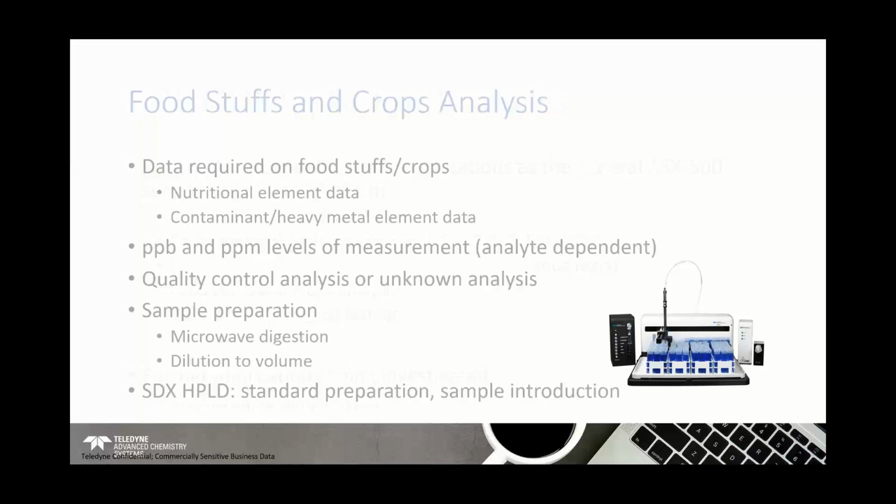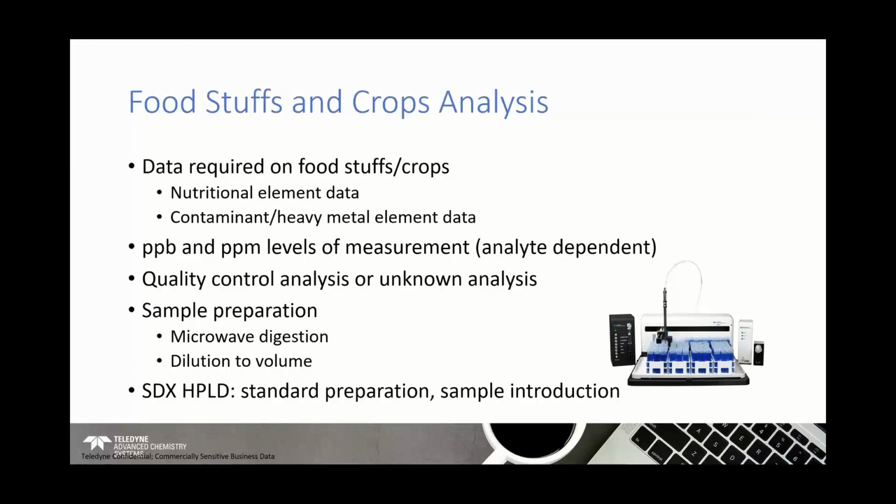So from that list, what I wanted to focus on was two areas of application. So I'm going to focus on foodstuffs and crops, etc., and then also waters analysis. But as part of this discussion, what I wanted to do was bring in and really focus more on the dilution required and the responsive dilution if there is an analytical failure as part of the batch analysis.